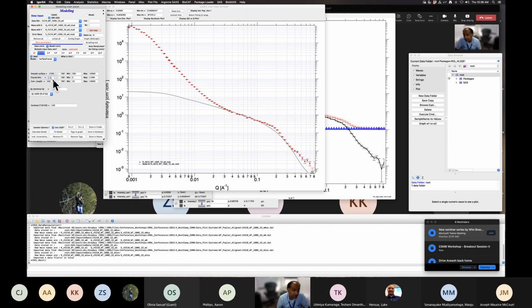Now the surface fractal over here means the smoothness is basically telling you the scaling up and down. The fractal dimension here tells you the slope. That means this slope here. Right now I'm leaving it at 2.5. This dimension is basically 6 minus whatever number you are from the exponent. And the correlation length of 500 is where this straight slope levels off.